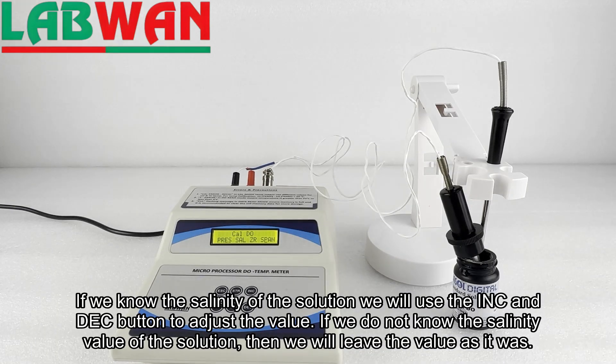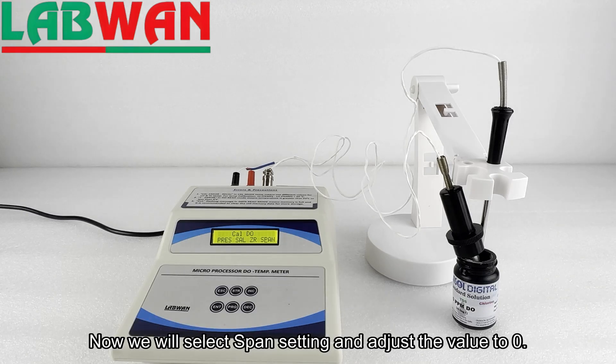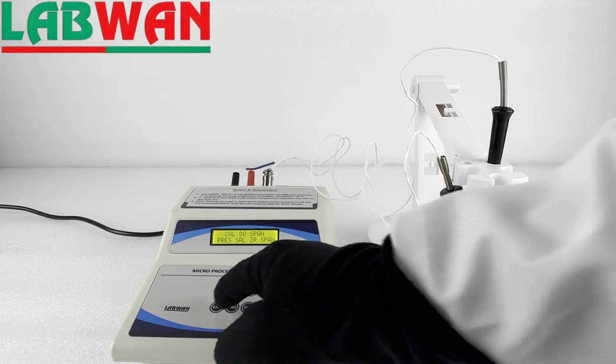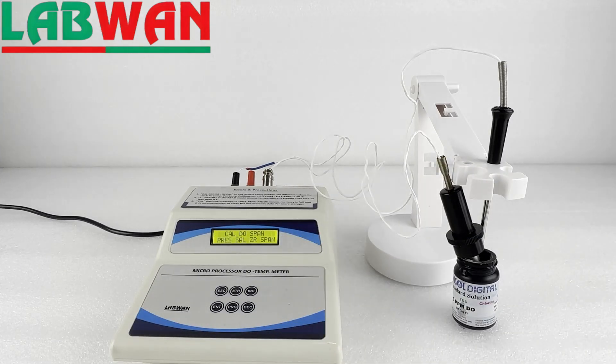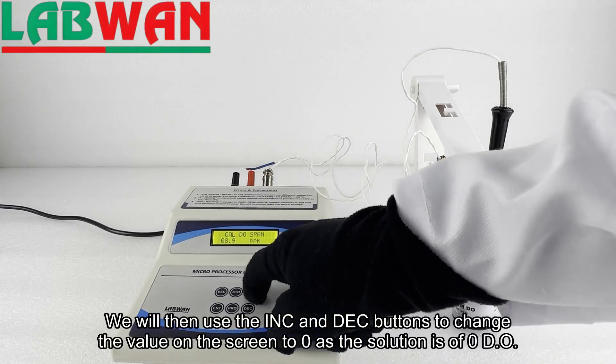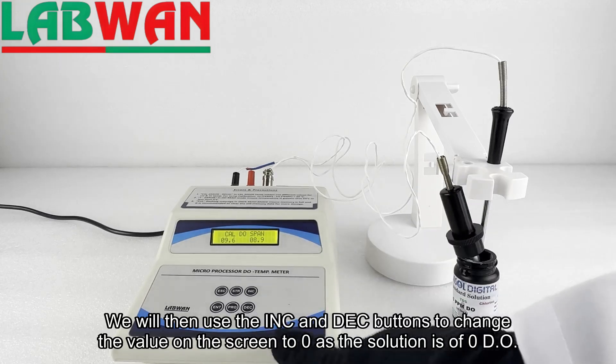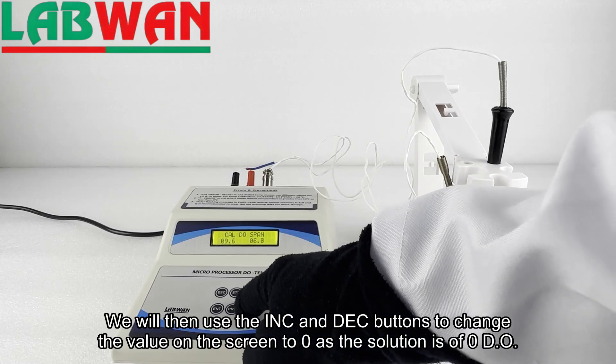Now we will select the span setting and adjust the value to zero. We will use the INC and DEC buttons to change the value on the screen to zero, as the solution is of zero DO.